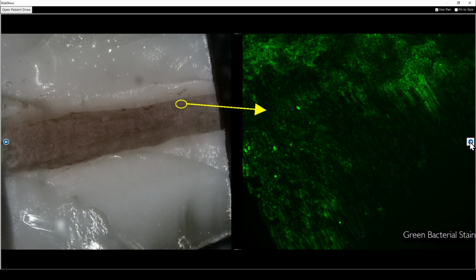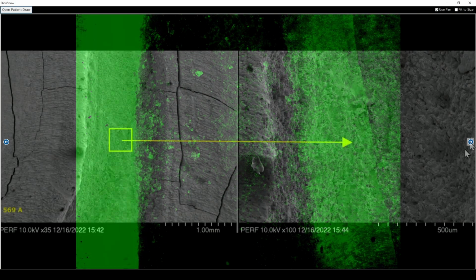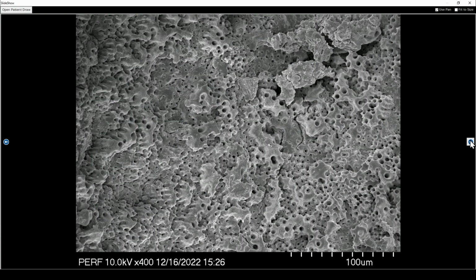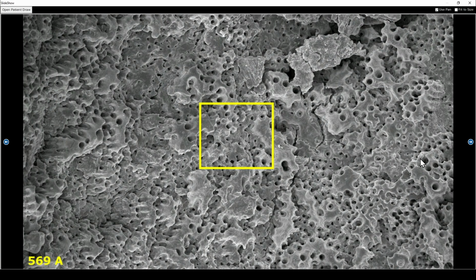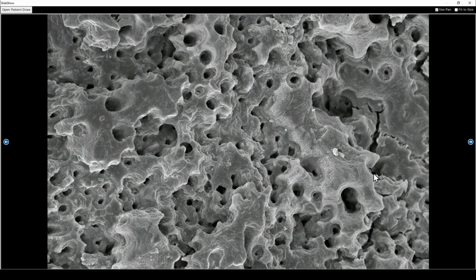So when you look at a specimen, now I've used the green fluorescent probe, and now I know that that canal is filled with bacteria. These are confocal microscope shots of what the canal actually looks like. Anything that's green is bacteria. So I know the canal now is filled with bacteria. And then when you go in and try to correlate, well, where is that bacteria? It'll give you a sense of what the bacterial signatures actually look like, because you know that there are bacteria there. And when you look at it, you start to pick up and recognize these signatures eventually.